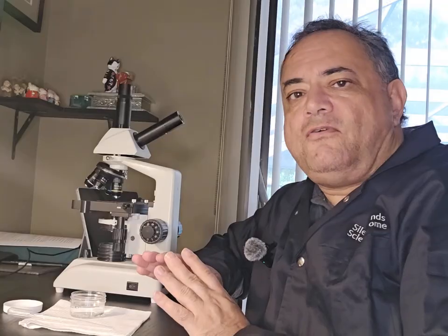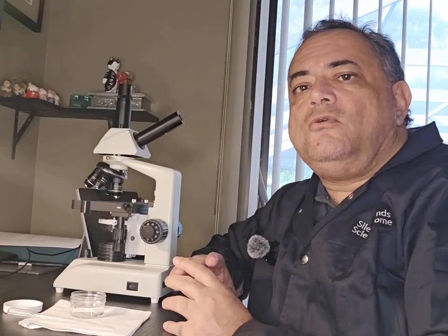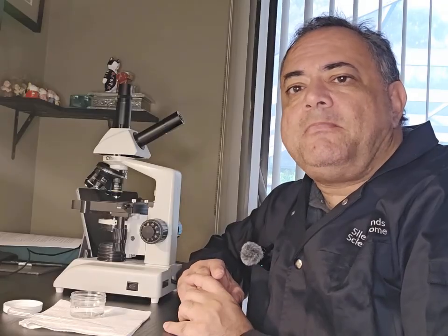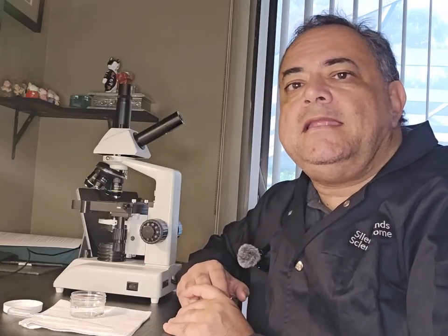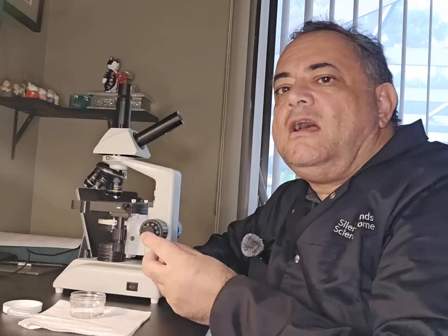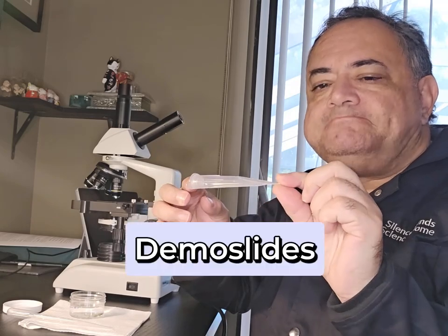So in order for me to look at the tardigrades under the microscope, I typically don't use a microscope slide and cover slip. I don't want my microorganism to be squashed or inhibited in any way. So what you can purchase are what they call demo slides.